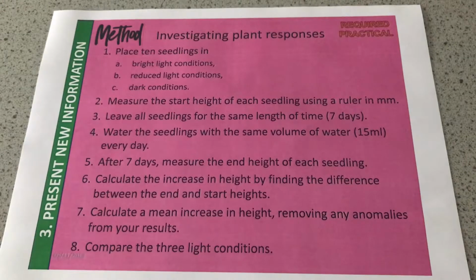So our method needs to be... We're providing this method for somebody who has an understanding of science but has never looked at this particular investigation. So it needs to be detailed enough that they could follow it, and detailed enough for lots of people to follow it and be able to share their results. So they need a method that is informative enough that they can do it and they don't have to make assumptions for themselves. For that reason, we give actual values to the length of time we're going to leave it, the amount of water we're going to give it. So let's have a look.